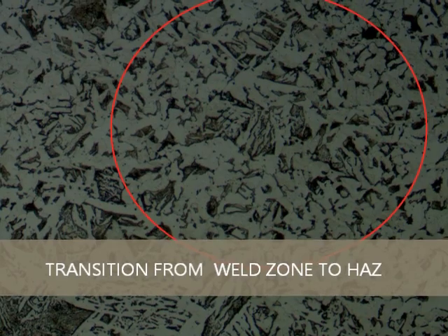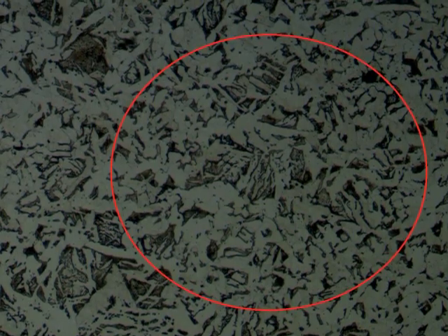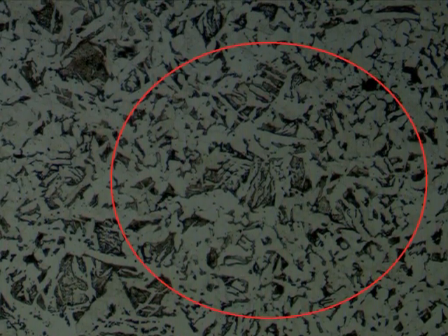In this picture, we can clearly see that there is transition from the weld zone to the heat affected zone. That is the weld zone having the larger grains to the heat affected zone having the smaller grain size.